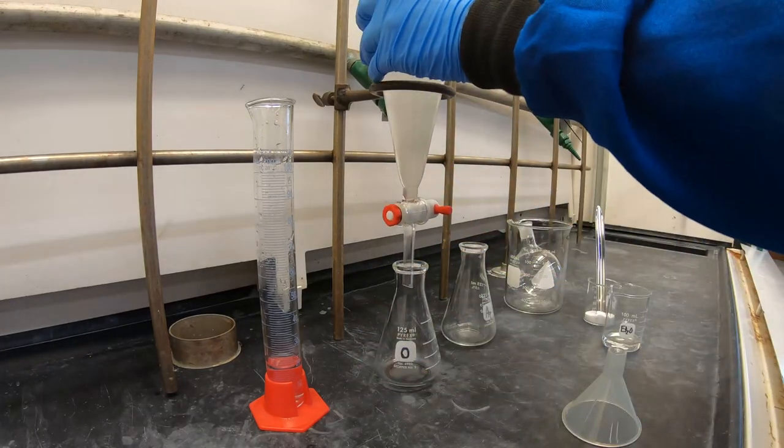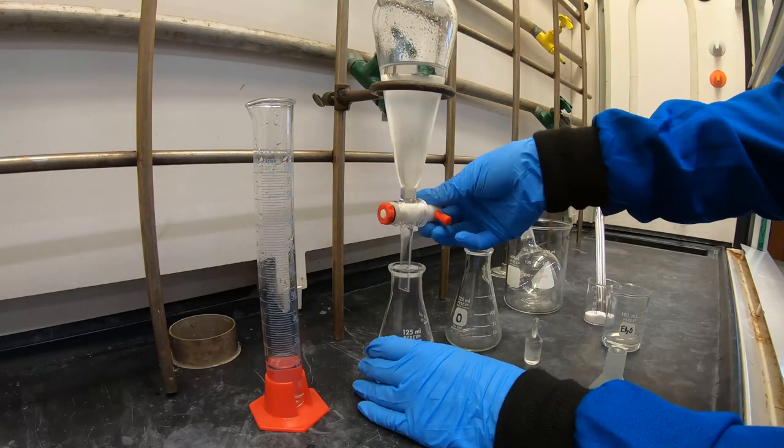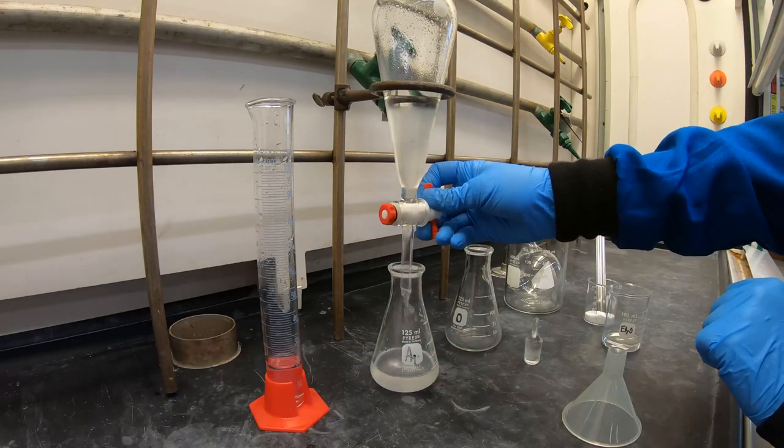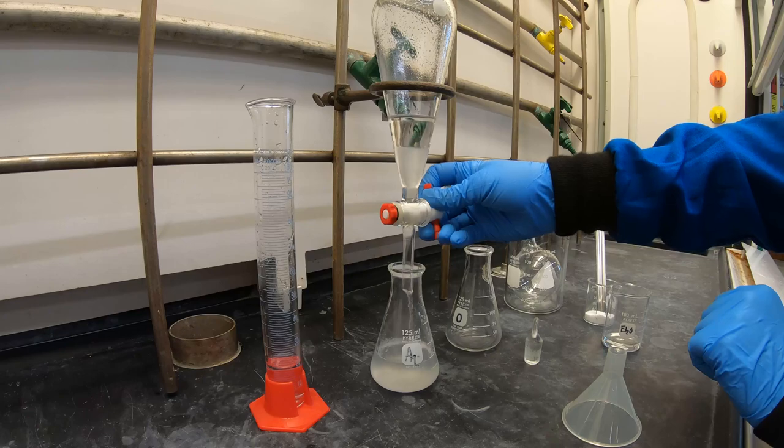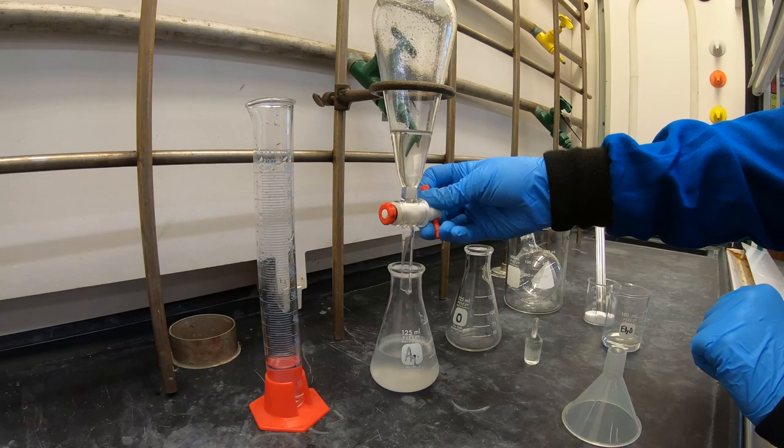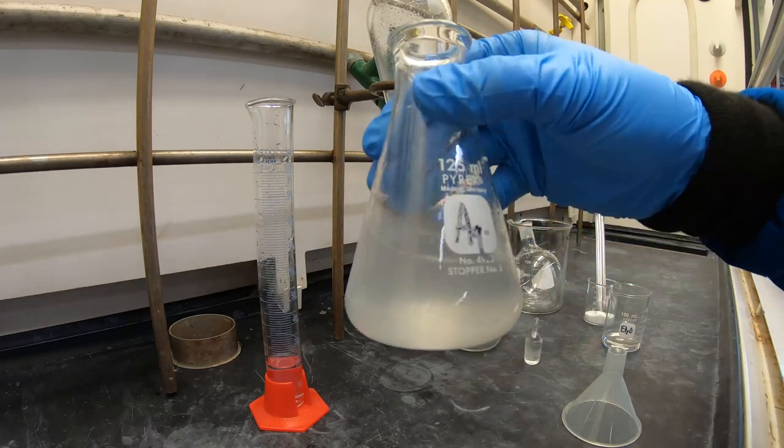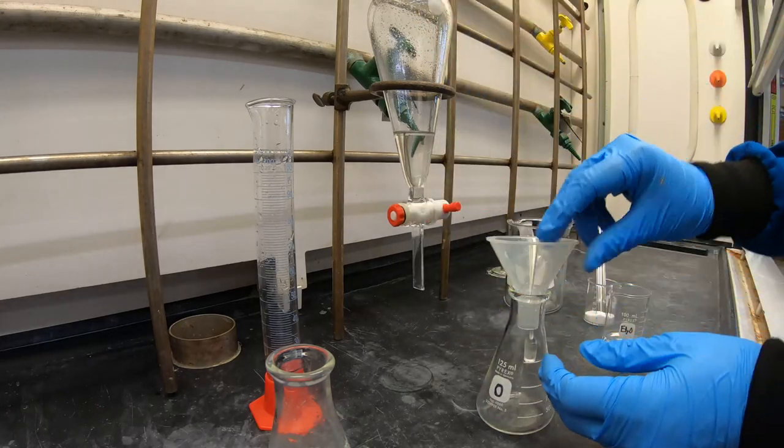You'll recall that the density of ether is lighter than water so the ether layer is on top and you'll notice this as a yellow hue. Now you need two Erlenmeyer flasks, one labeled for your aqueous layer and another for the organic layer.